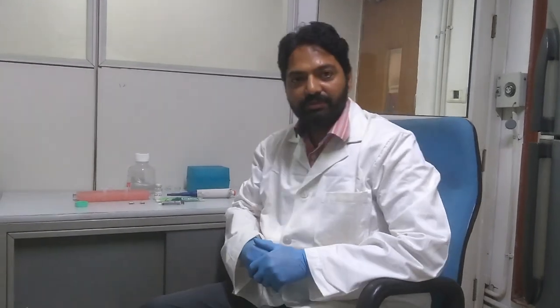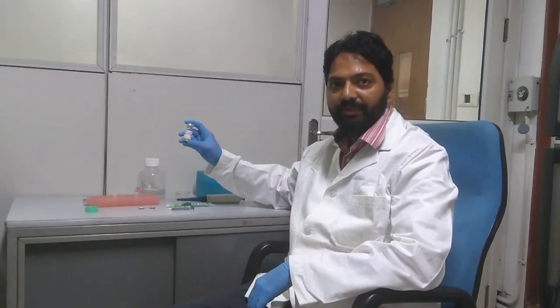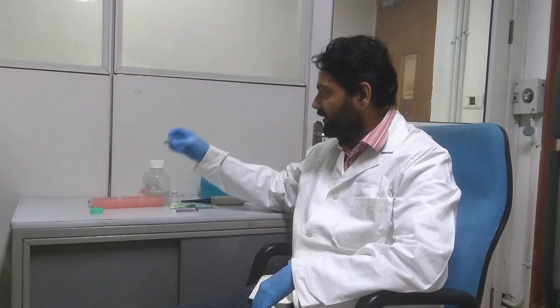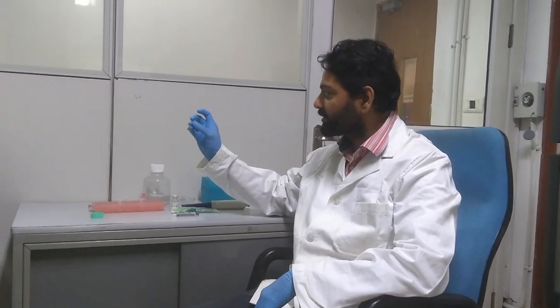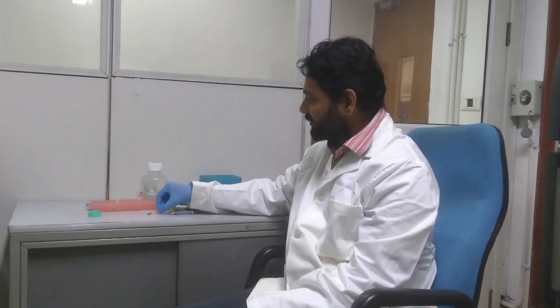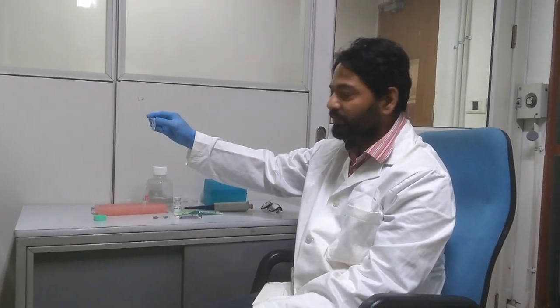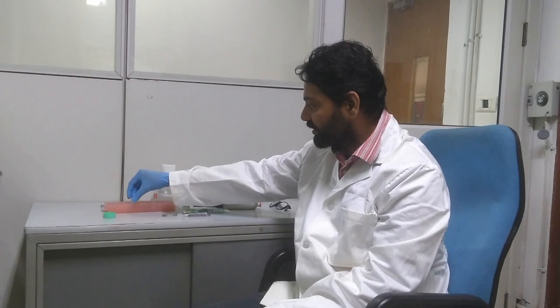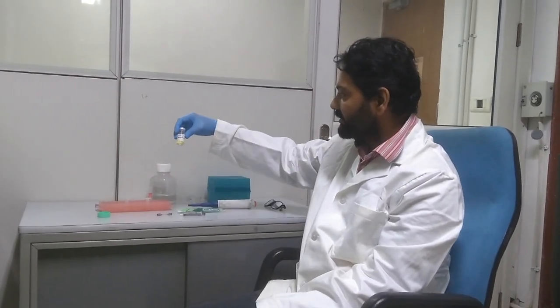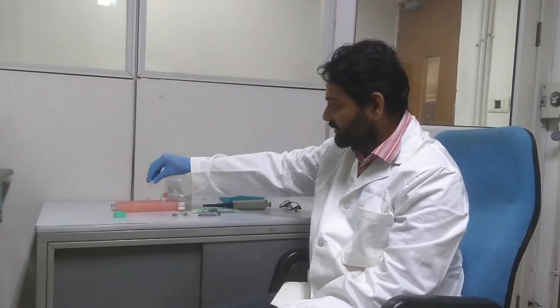For the first step, we require several things like Freund's complete adjuvant. Here it is from Sigma. We need a microemulsifying needle which has two openings connected with a fine needle. We need antigen which is purified and filtered, so there are no contaminations. It is a sterile solution of antigen. Then we take out some of the Freund's complete adjuvant in an Eppendorf tube and then mix them together.